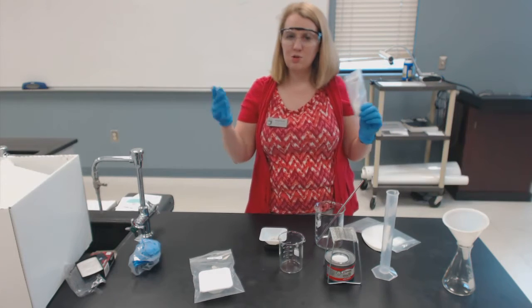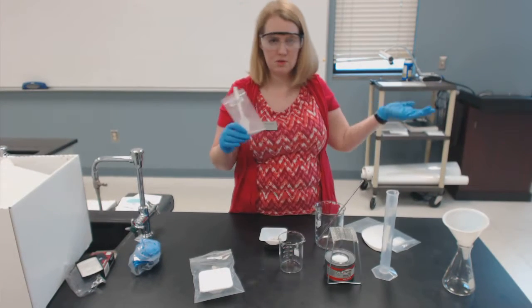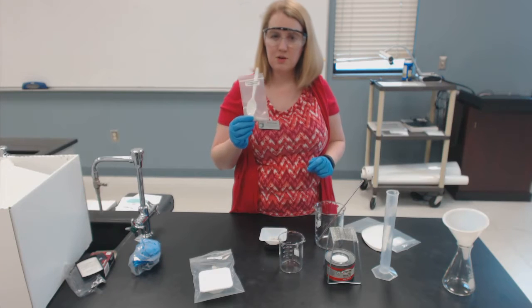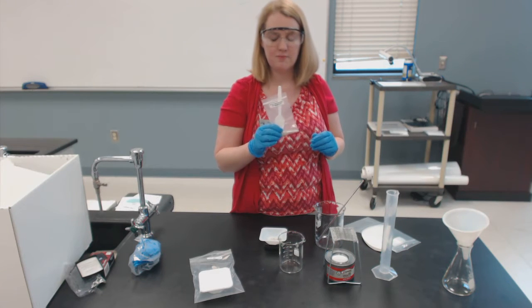So the high school version of this lab was just salt and sand, and it asked you to separate the mixture. So dissolve the salt in the water and filter out the sand, and you've separated the mixture. By adding a third component in, now you're going to have to do more critical thinking to figure out how am I going to separate it.